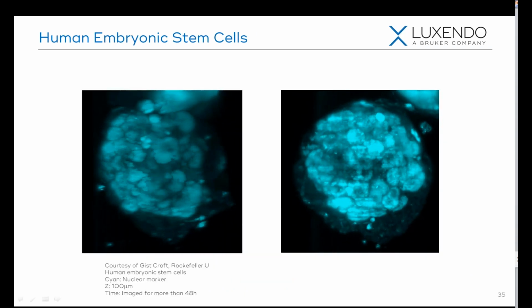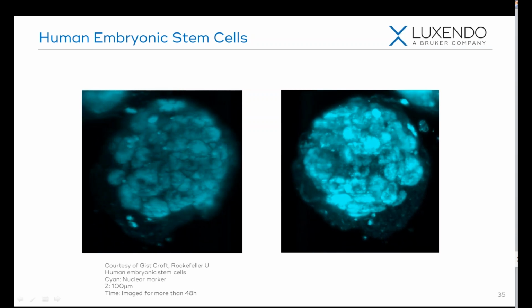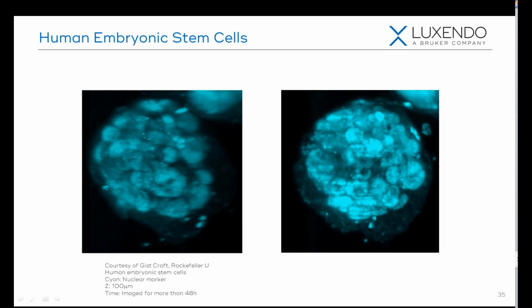Another popular culture these days is organoids and spheroids. And here, what you're looking at is an organoid, and we image this for more than 48 hours.